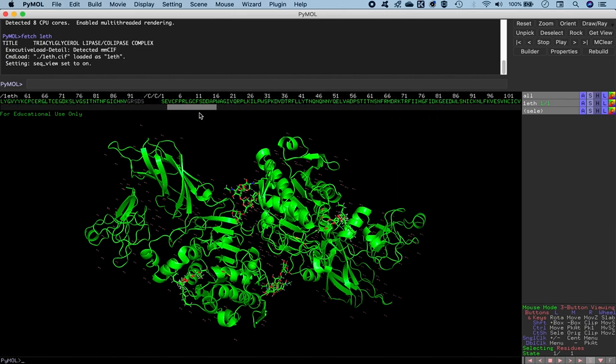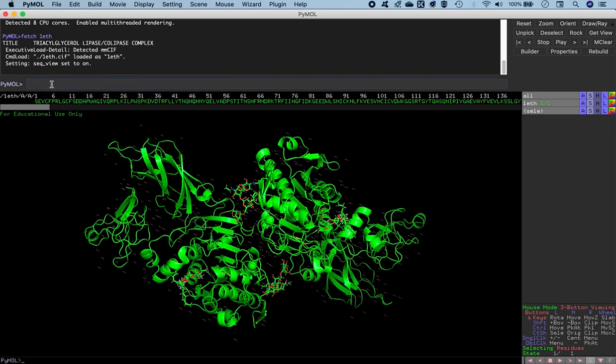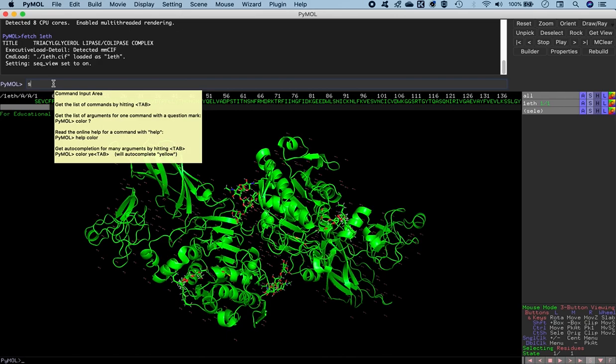So in order to get rid of all the chains, but just retain the colipase, which is the chain of our concern, because this is the fragment that is having all the missing residues here in the N terminal and the C terminal, we'll just get rid of all the other chains. We'll remove all the other chains and just retain chain B. So in order to do that, just go to the command line interface of PyMol and do a selection.